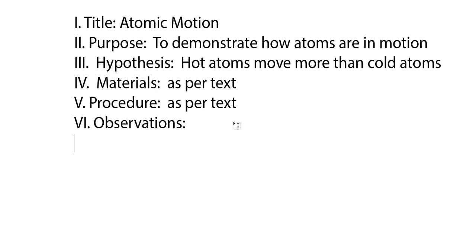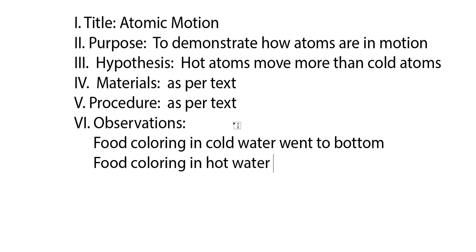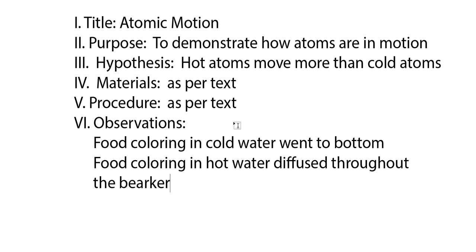So under observations, we're going to say: food coloring in cold water went to bottom. Food coloring in hot water diffused throughout the beaker. Not the beaker. Beaker. There we go.